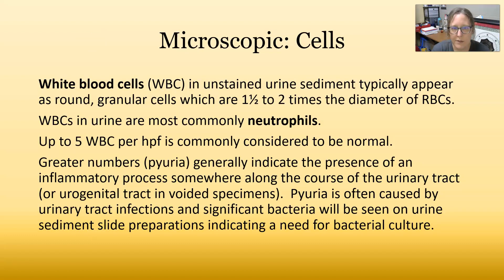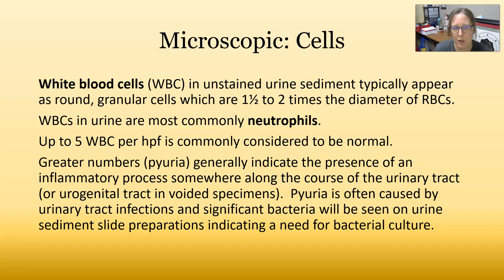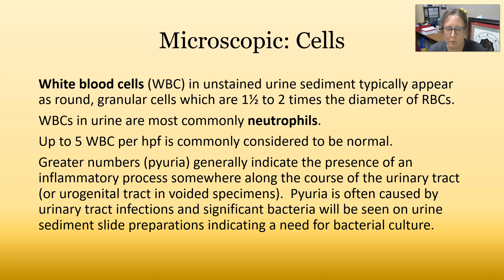White cells in an unstained urine sediment typically appear as round granular cells which are one and a half to two times the diameter of red cells. White blood cells in the urine are most commonly neutrophils, meaning they are there to fight off an infection. Up to five white blood cells per high power field is commonly considered to be normal. The high power field is the 400x magnification field, using the 40x objective lens with the 10x ocular.